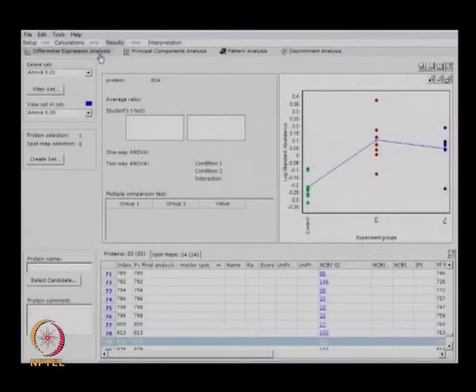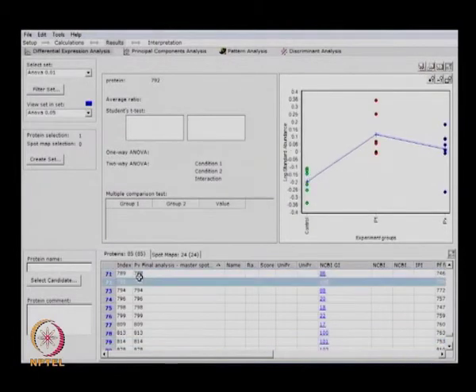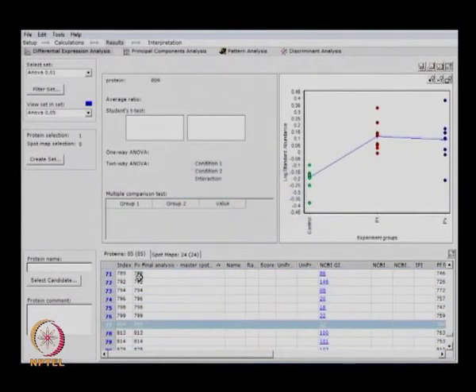The thing we can see here is differential expression analysis, in which you can see differences between control as well as two experimental groups. These are the different treatments which were given. Here you can see how a particular protein is expressing throughout the control as well as PF and PV, and you can see this kind of data for each individual protein here, so that from here you can see which is of your interest and which is not.